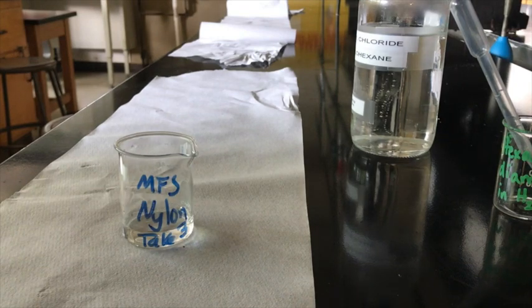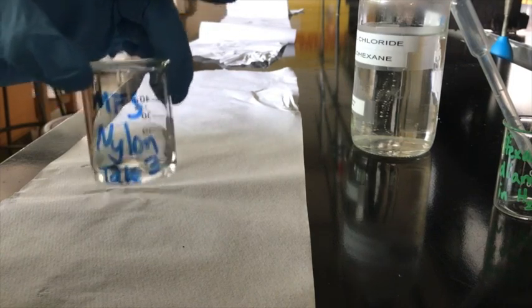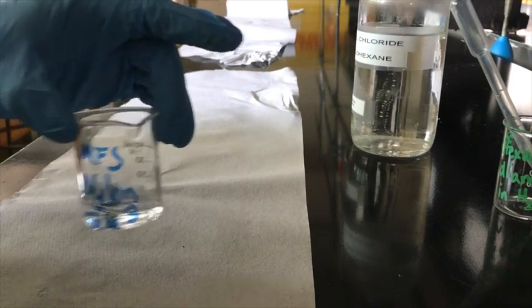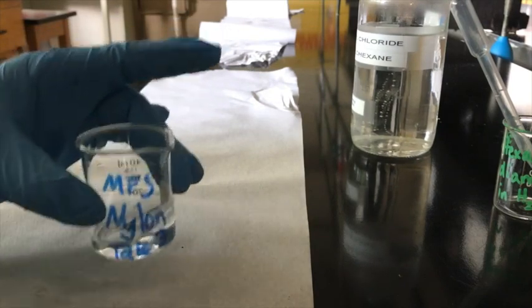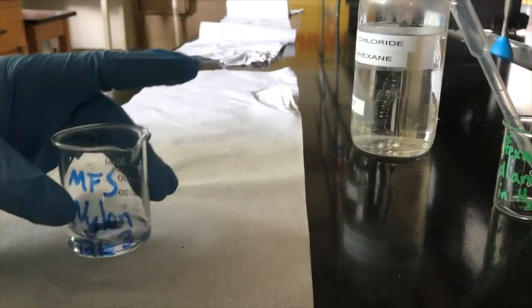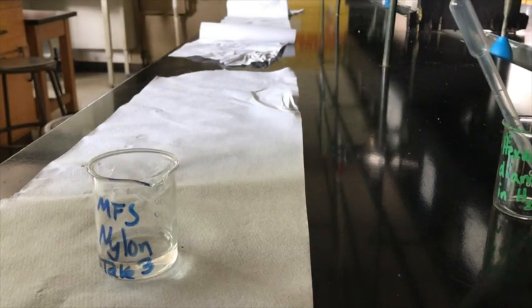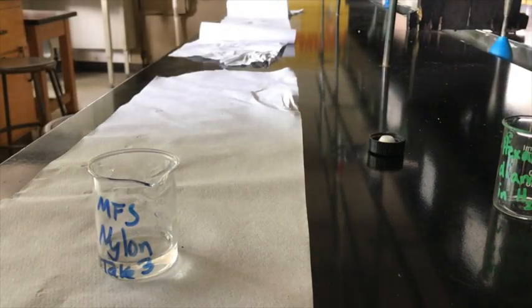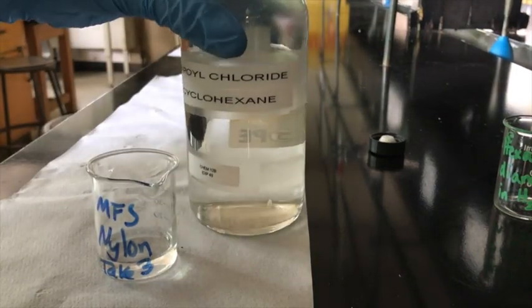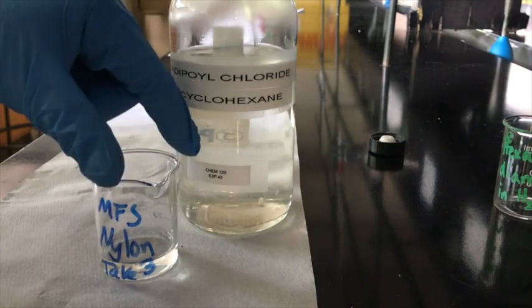Third time's a charm. I'm gonna swirl that around a little bit. So what I'm doing is I'm making sure my aqueous solution is basic, so that when the amine reacts with the acid chloride, there's a base there to deprotonate. So instead of the amine being protonated, the hydroxide is protonated. So now for my diacid chloride, my adipoyl chloride, I've got to add about 10 milliliters of that.